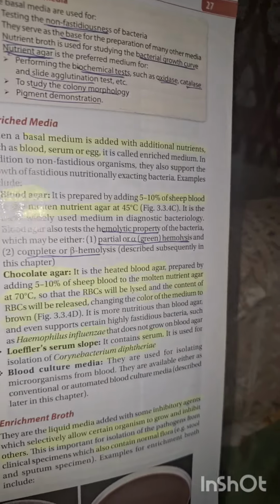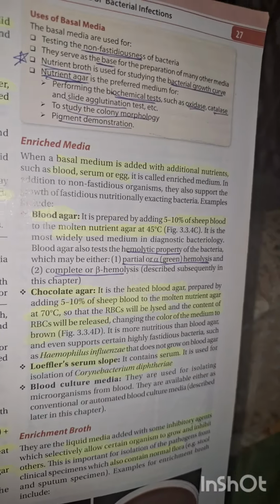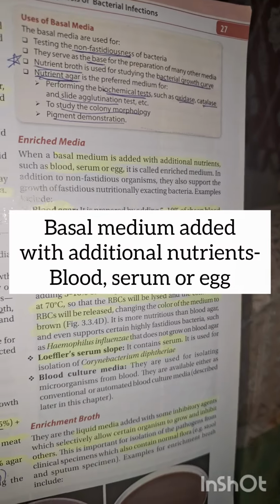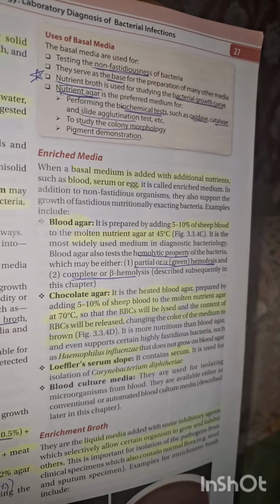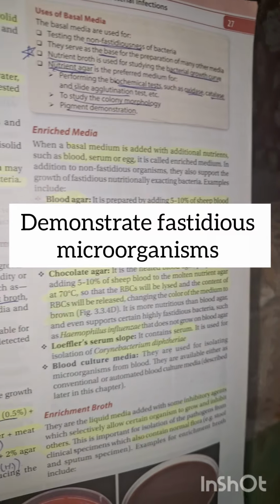So in the last shot I discussed the simple or basal media. In this shot I will be discussing the enriched media. So enriched media is formed when a basal medium is added with additional nutrients like blood, serum or egg. In addition to non-fastidious organisms, it is used for the demonstration of fastidious organisms.